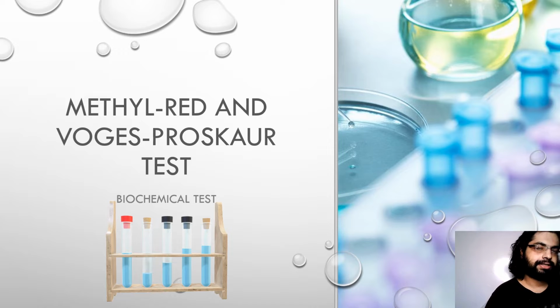Both these tests are taken simultaneously and are thus performed on the same medium, MRVP broth. It is not a solid medium in which it is performed, so it is taken as broth, MRVP broth.